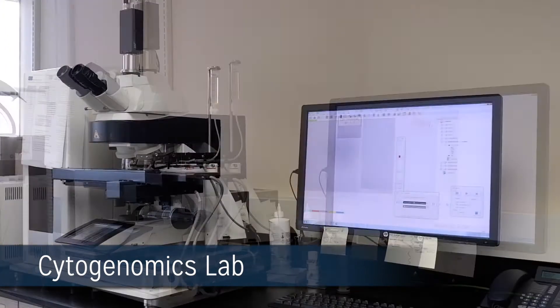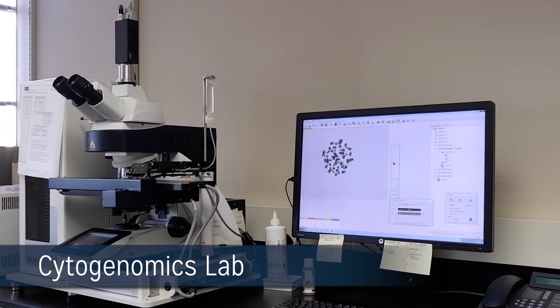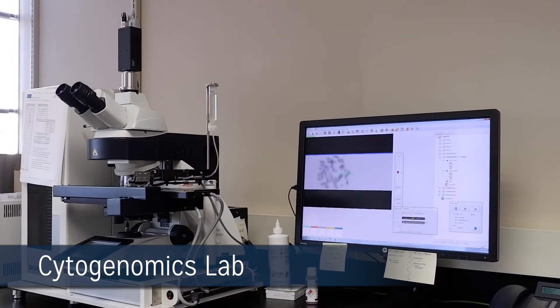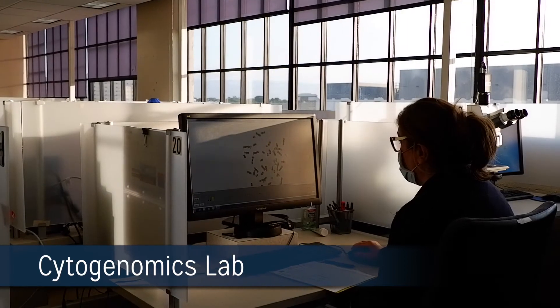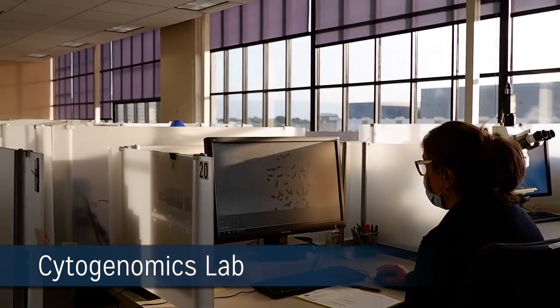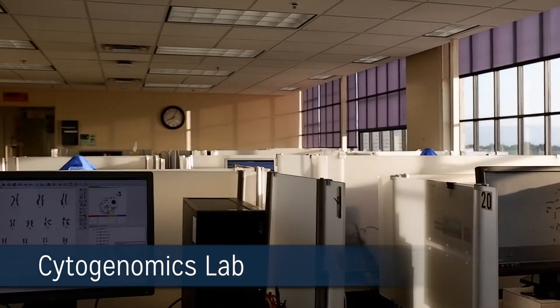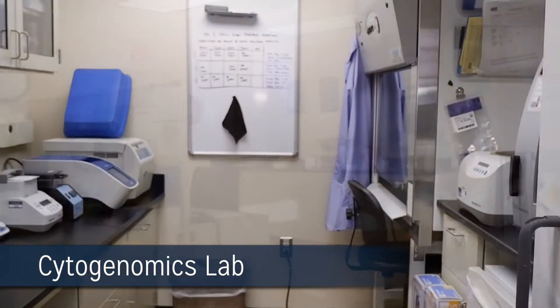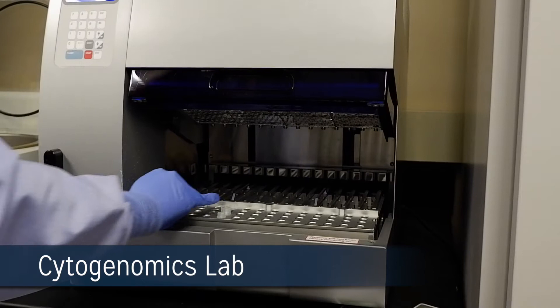Technologists are able to digitally analyze their cases in real-time, providing clinicians with preliminary data to assist with diagnosis, prognosis, and treatment options for their patients. Our laboratory processes over 5,000 cases per year and with ongoing process improvements, could increase capacity to meet the needs of our clients inside and outside the Henry Ford system.